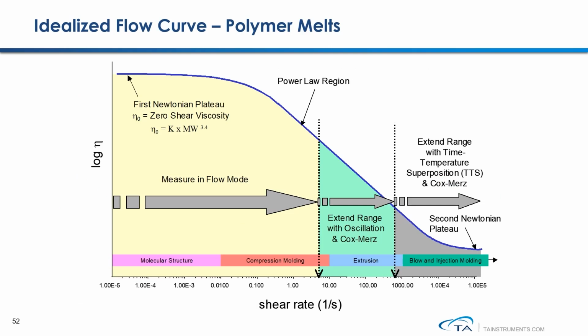Understanding the viscosity of polymer melt is important because polymer melt's viscosity as a function of shear rate can be used to correlate to polymer's molecular architecture and also can be used to guide polymer processing. The viscosity of a polymer melt measured under low shear rate, especially when it's extrapolated down to zero shear viscosity, can be used to quantitatively calculate polymer's molecular weight.